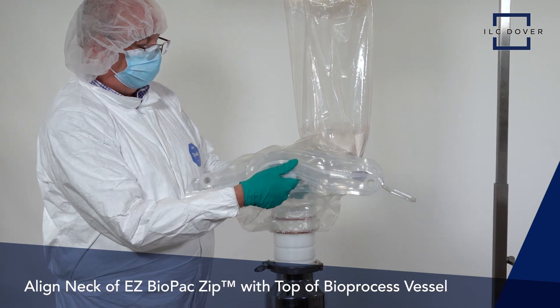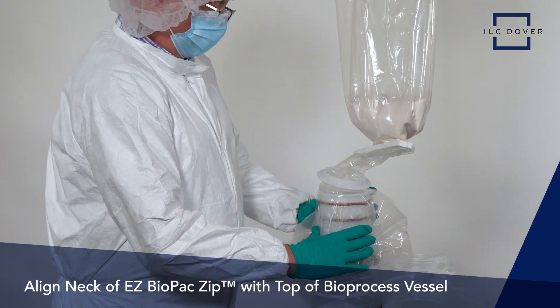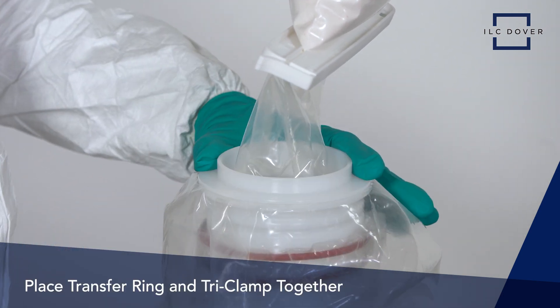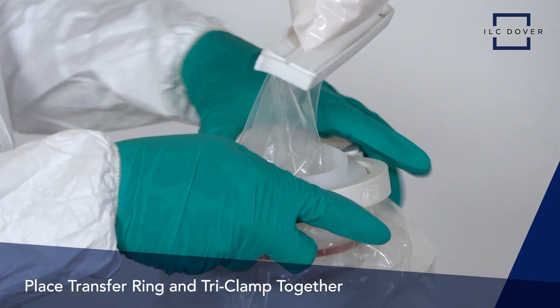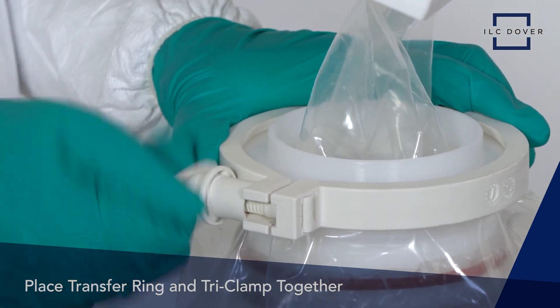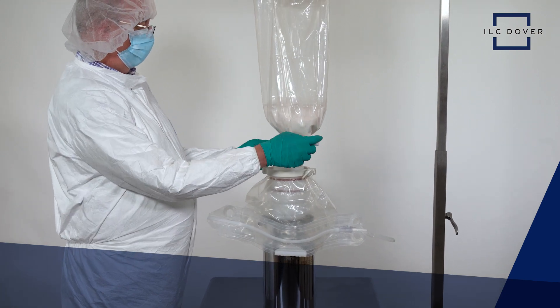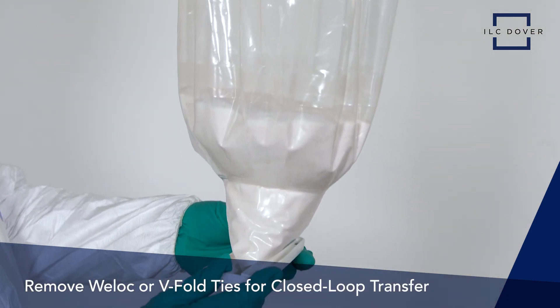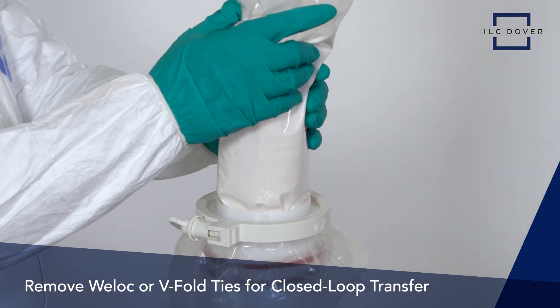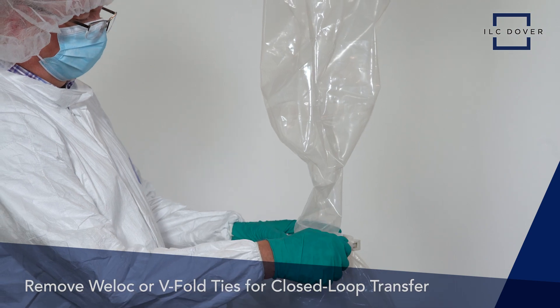Bring both assemblies together and zip the upper and lower zippers with the provided slider to lock them in. Now, pull the whole zipper unit down until the neck of the EZ Biopack aligns with the top of the bioprocess vessel. The transfer ring now needs to be placed outside of the EZ Biopack Zip bag and tri-clamped together. This ensures that there is no escape of powder into the zippered area during powder transfer. The powder can now be transferred from the upper assembly into the bioprocess vessel. Remove the wheel lock or V-fold ties to open the channel between the upper and lower assemblies for a closed-loop transfer from the bag through the canister into the discharge vessel or mixer.